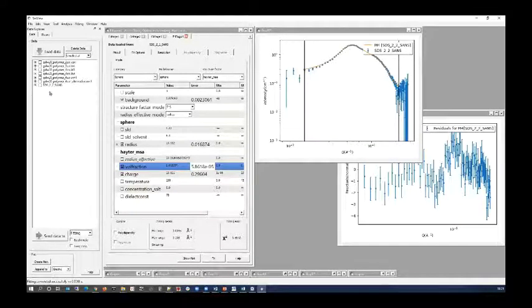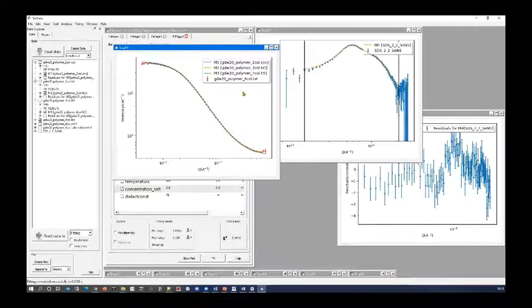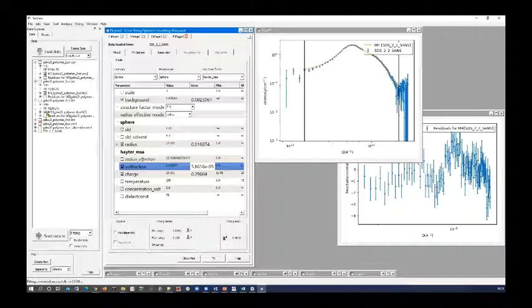So if I just go back to the polymer data, we fitted the 2-column, the 3-column, and the 4-column data, and you can see that the models are now available over here. If I want, I can choose the experimental data, and then the 3 model fits to it, and then down here in the bottom left corner, I can go create new. It'll create a plot, and there's that polymer data with the 3 fits in there. And again, if you want, you can save that or print it, copy it, whatever you want to do.